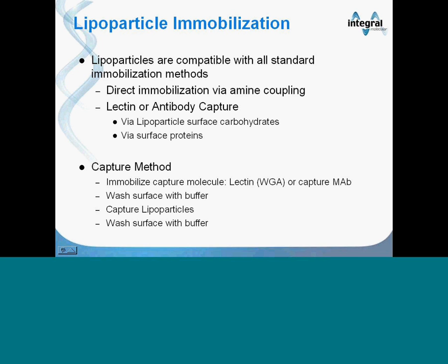So here's another visual of the capture process. On the ProteOn, capture is done in the vertical direction. First, the capture molecule is covalently attached to the chip surface, and then lipoparticles are flowed across in the same direction. In this assay layout, we're going to capture CXCR4-containing lipoparticles on the first flow channel, and then control lipoparticles on the second channel.